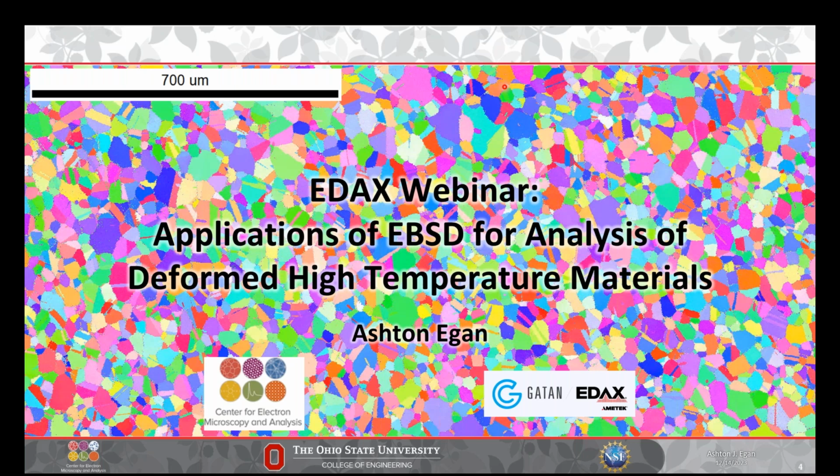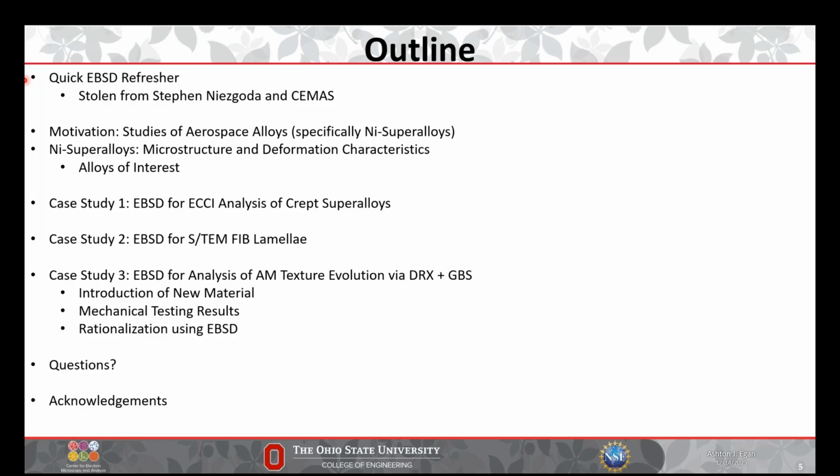So today is really meant to be, I guess quick, not quick, it's quite long actually, but it's basically just showing some ways I use EBSD in my day-to-day research, and not so much a deep dive into niche EBSD techniques. So what I'll do here is give a quick EBSD refresher, just so we're all on the same page.